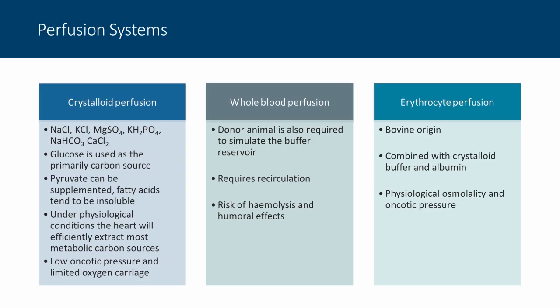Conversely, when we consider that the perfusate coming back from the ex vivo heart may contain contaminants, this can have an influence on the donor animal. And these are considerations that need to be addressed as factors in developing experimental protocols.